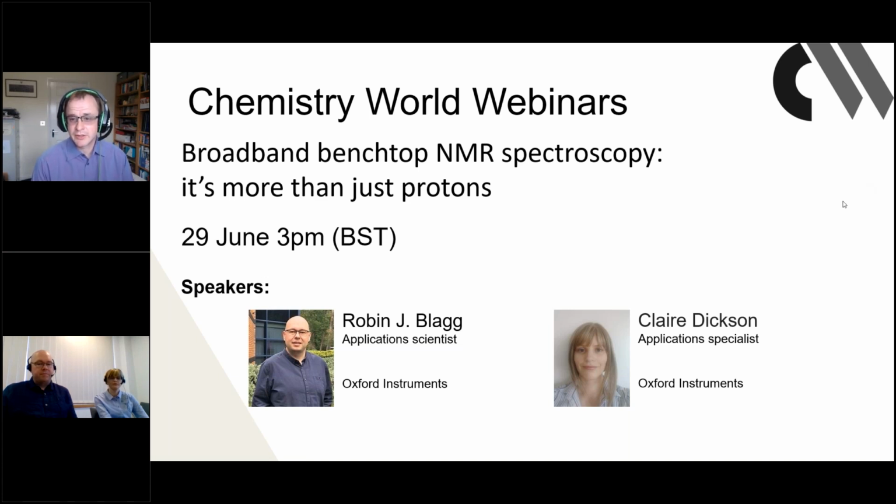Today's webinar is about using benchtop NMR to probe a variety of different NMR active nuclei, including some of the slightly more exotic ones beyond proton and carbon NMR, such as phosphorus, lithium, boron, silicon, that kind of thing. From pharmaceuticals to battery research, teaching, all sorts of areas, having access to a broadband spectrometer right there in the lab can give you the opportunity to get some really unique insights into the chemistry that you're investigating.